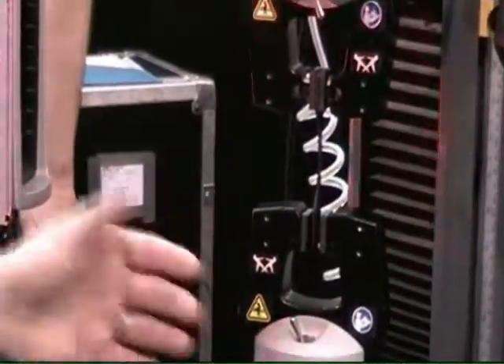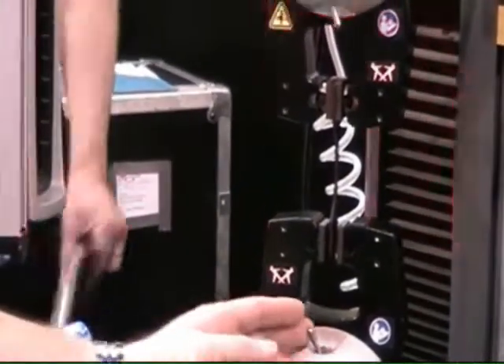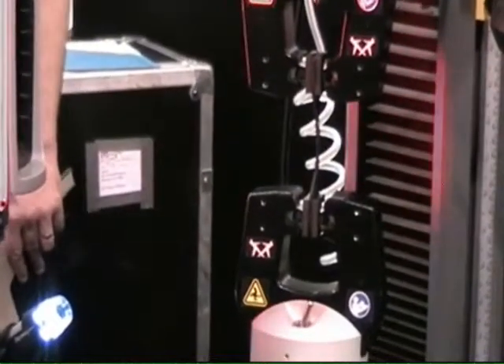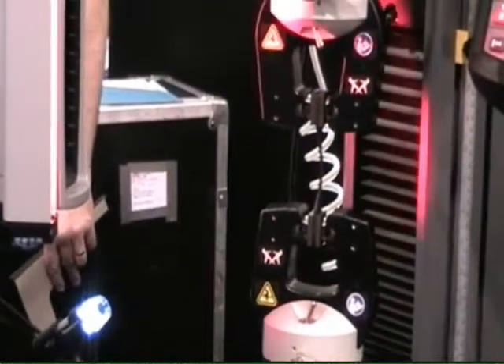There's shields that go over there, specimen centering, and specimen holding devices as well. The rate of grip opening can be controlled by the flow control, in addition to the lighter weight of many of the grips.